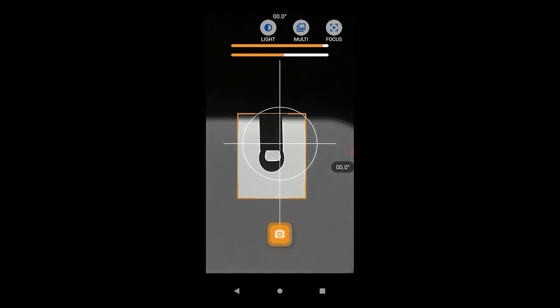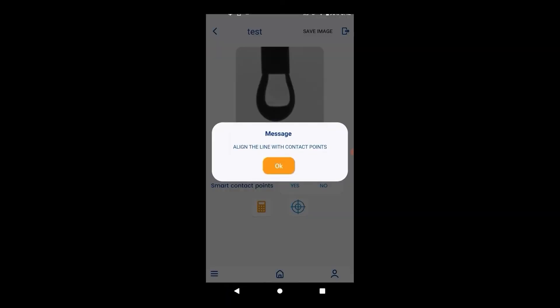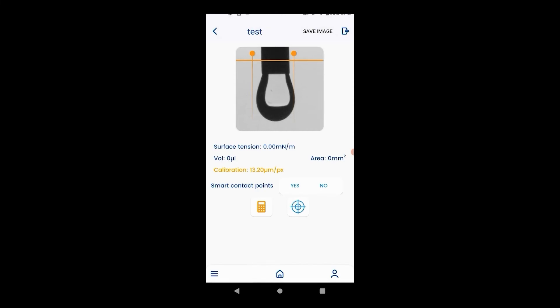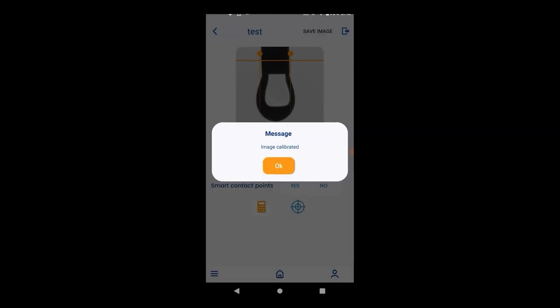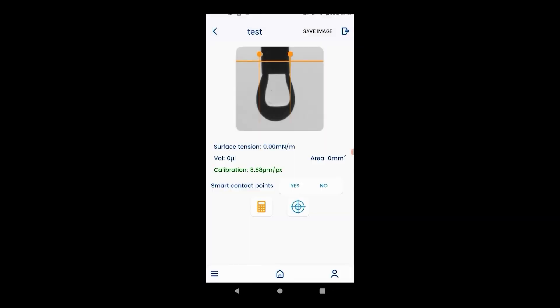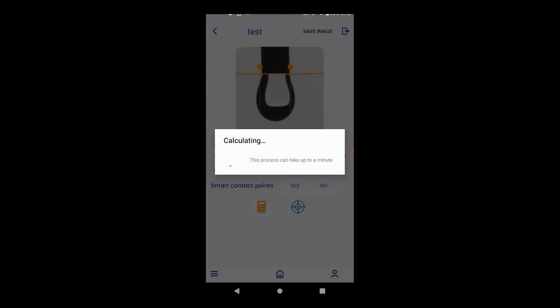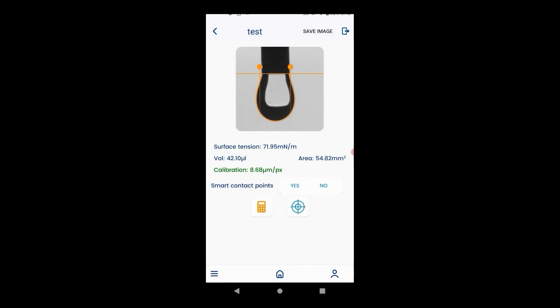Generate a droplet large enough that it is sufficiently deformed by gravity — a nice teardrop shape is recommended. It is best to aim for a droplet that is just about to detach from the needle. Move the orange points to the left and right of the needle and hit calibrate. If the calibration number is green, the number is correct; if red or yellow, something is wrong. Generally, the lower the calibration number, the better. Move the orange vertical bar to where the droplet meets the needle and the two points to both sides of the droplet, then hit calculate. This will give you the surface tension, the volume, and the cross-sectional area.